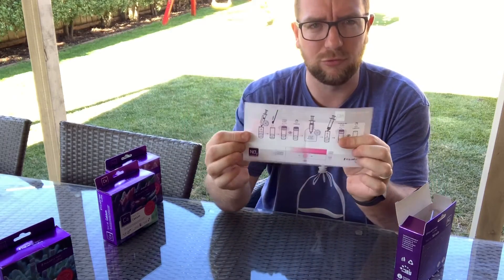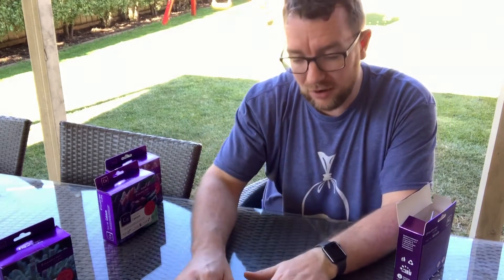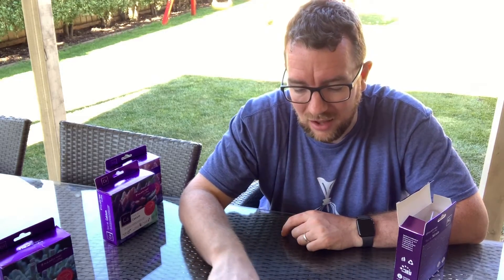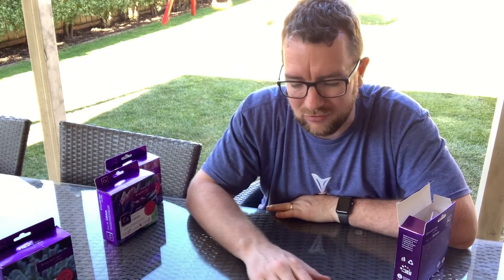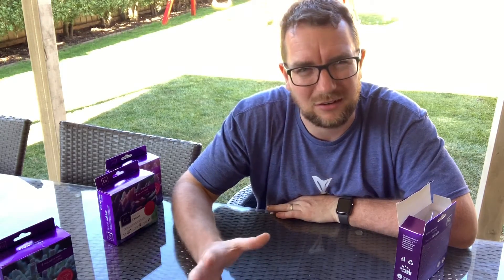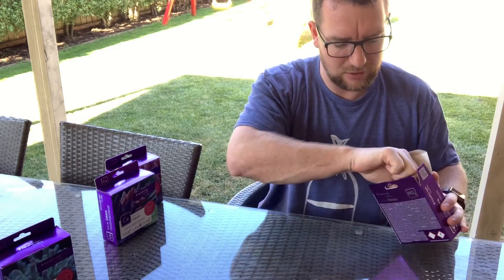First thing in the box, we get a waterproof card with a waxy coating — instructions on one side and the color slider on the other. My eyesight, with these thick glasses and being colorblind, means color sliding test kits always struggle with me a little bit. I tend not to get too caught up in the exact number — more just roughly where I am on the chart. If it's five and below, I'm in my sweet spot.